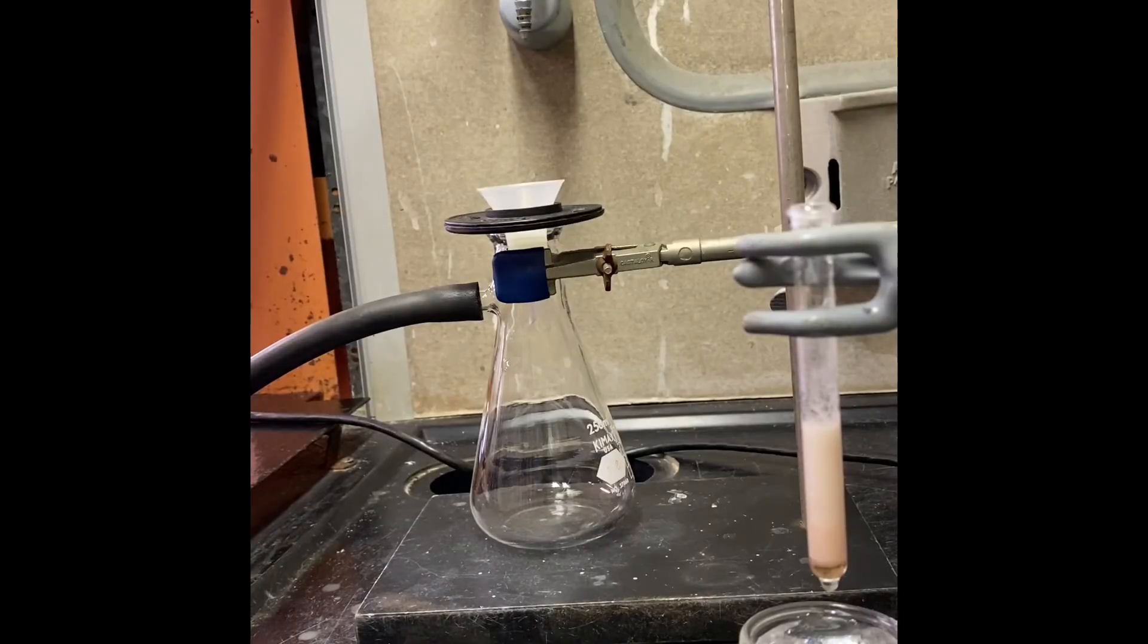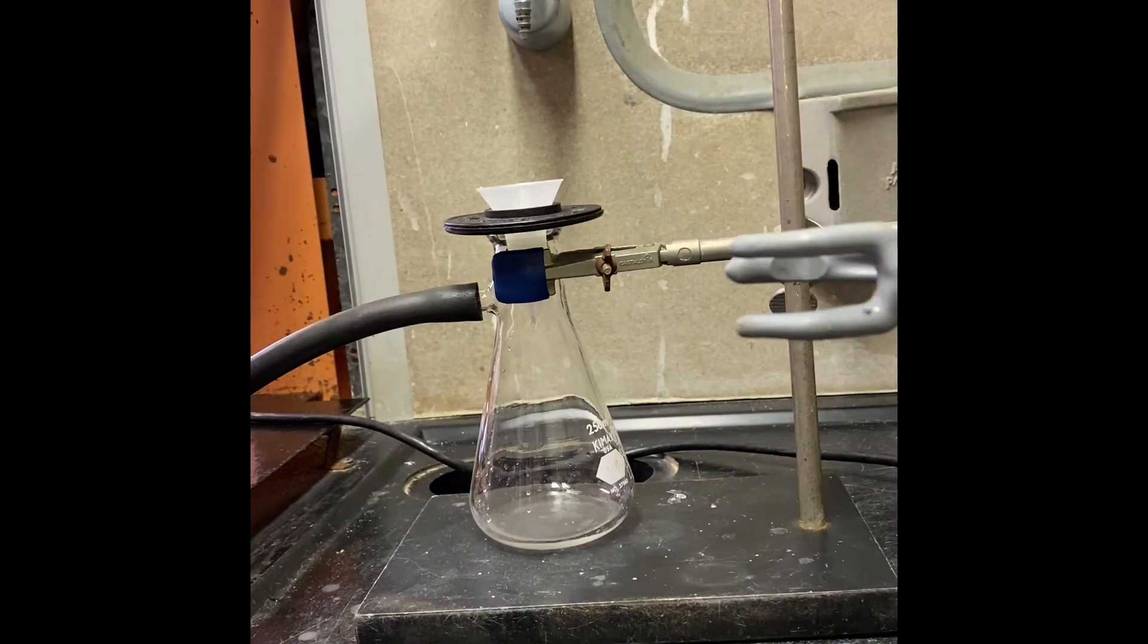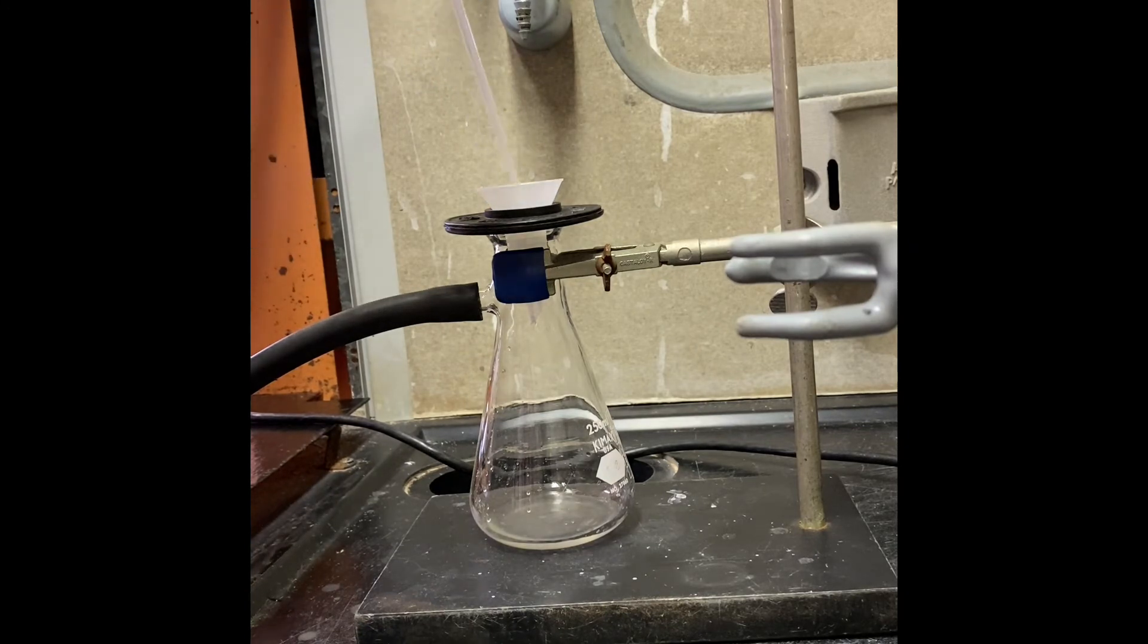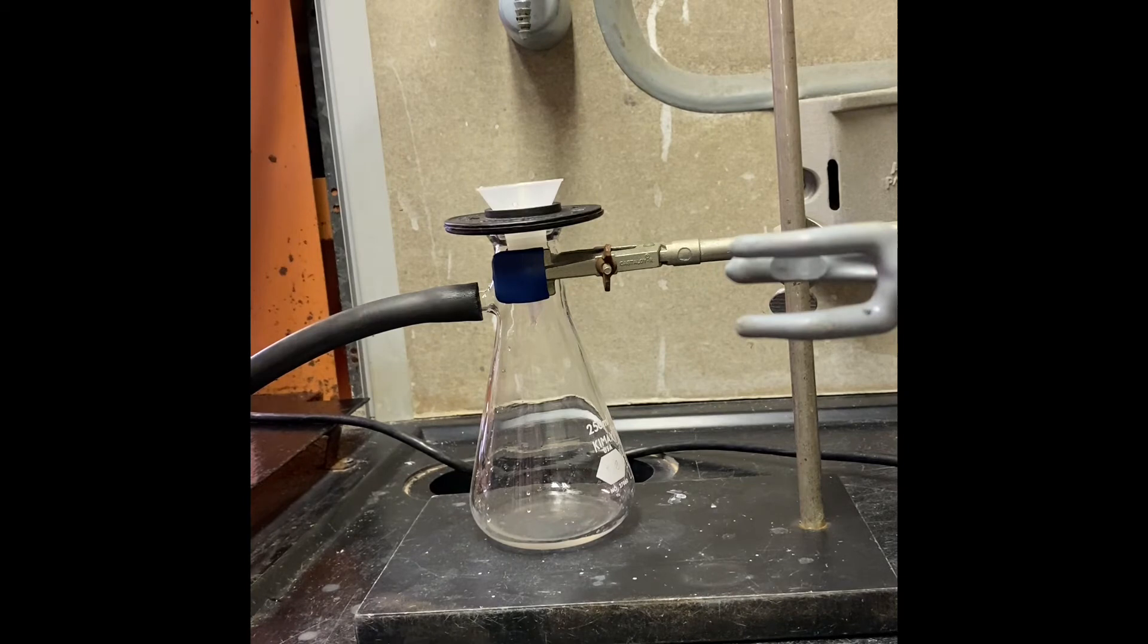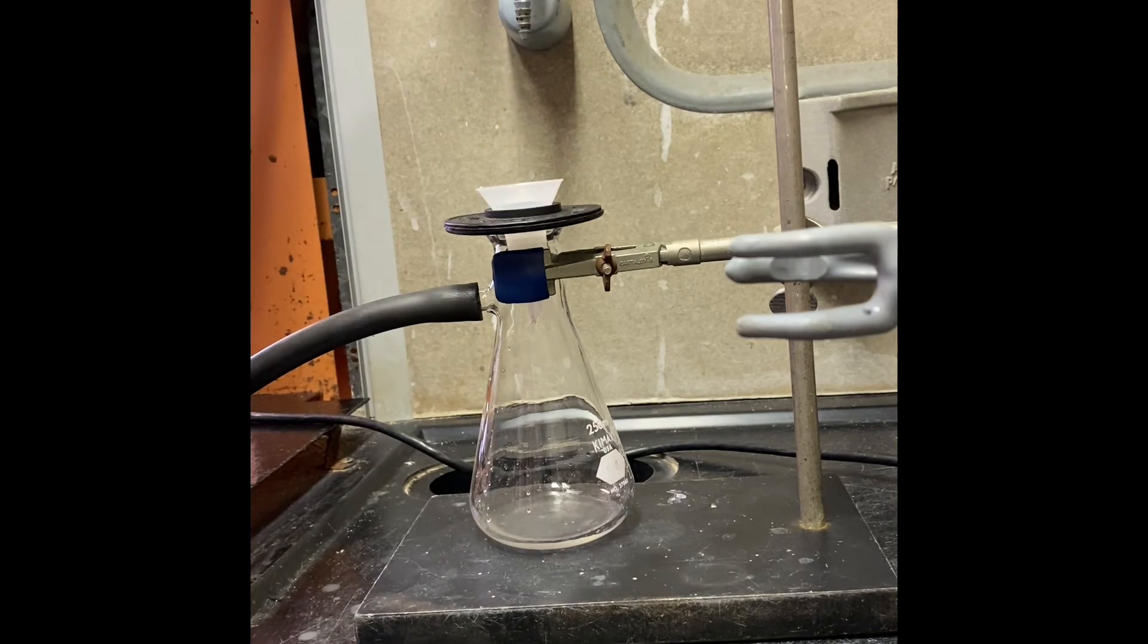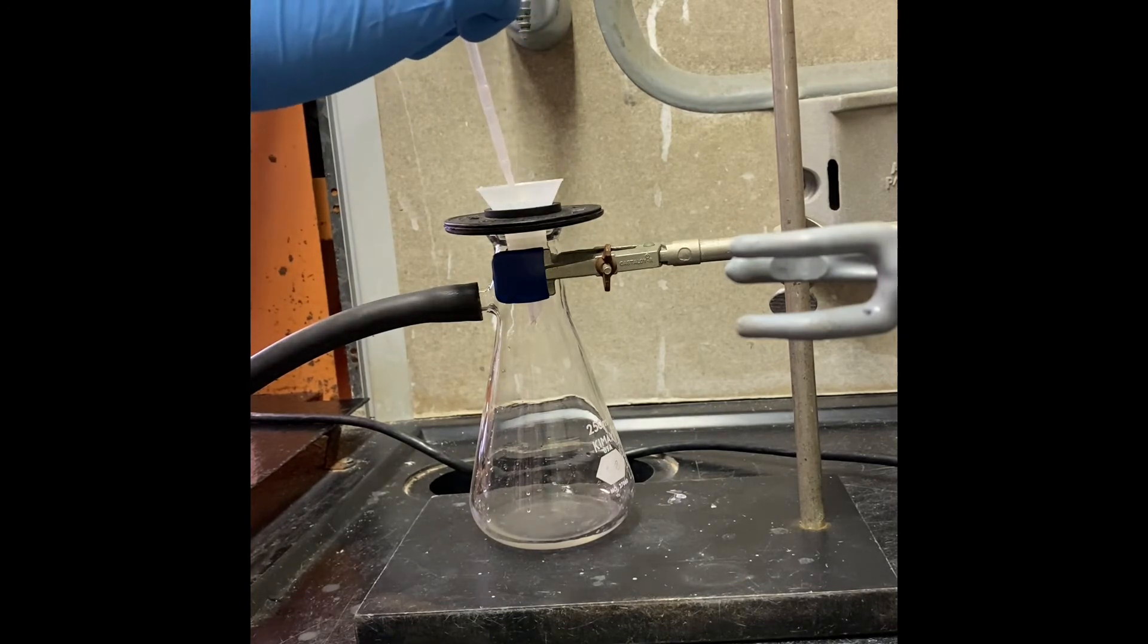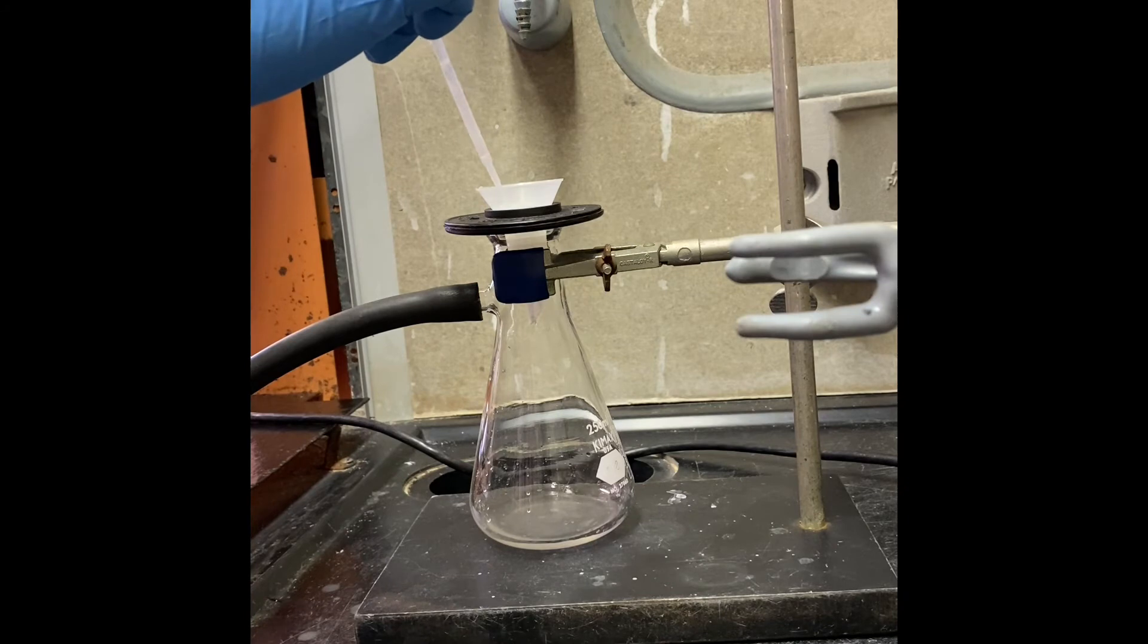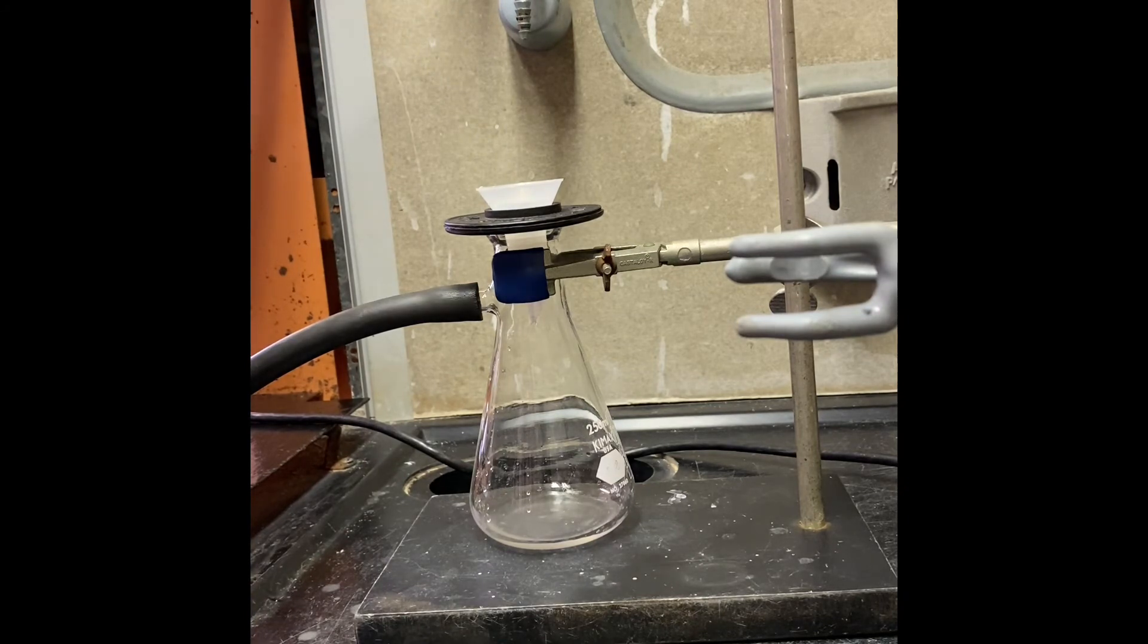This is our vacuum setup. For washing, we're going to add some water, so we turn off the vacuum. We're going to put some water, a couple of water, go back. Wash that out.